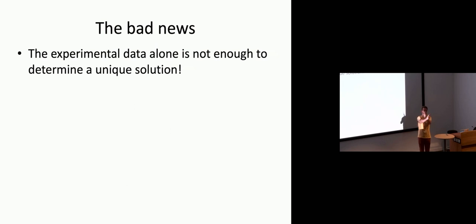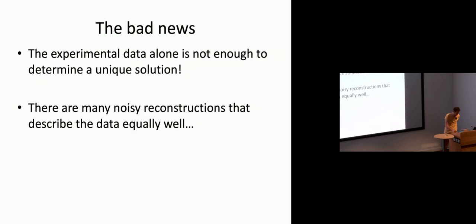set. And that's because this three-dimensional spider web of 2D planes that we build up is sampled a lot at the origin, because all the planes overlap there. But the further you go out in resolution, the less overlap there is between these 2D planes, so you have fewer points to sample, and if they're all very noisy, then the signal-to-noise ratio in the average will still be relatively low, and many different averages would be equally likely in the light of those data. Okay, so that's bad news, because that means there are many structures that could be the right one. How do I now know which one is the right one?